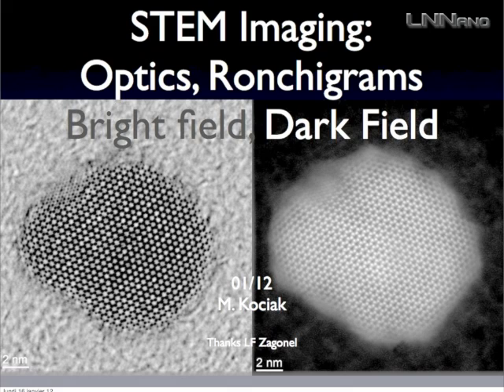So I just give here an example. It's a true one. There is nothing published or whatever. It's just a colleague of mine who came to me and told me, okay, I'm doing some nanoplatelets of cadmium selenium, so this is the CdSe. And he was a chemist, a brilliant guy, and he told me it's absolutely flat, it's perfect, it's squared, and so on. So this is here a bright field image.